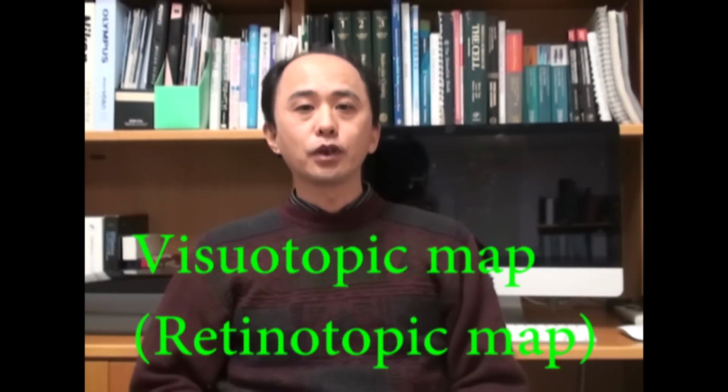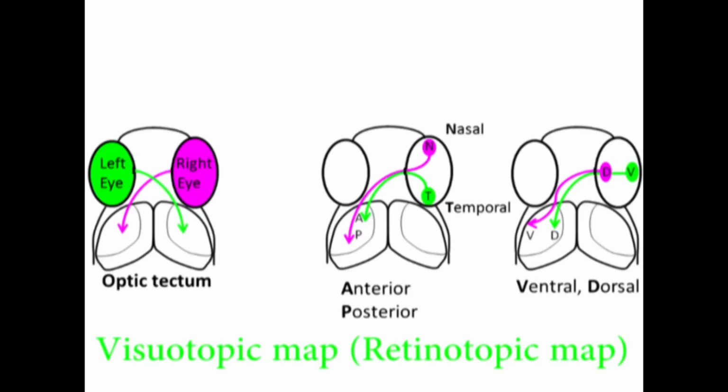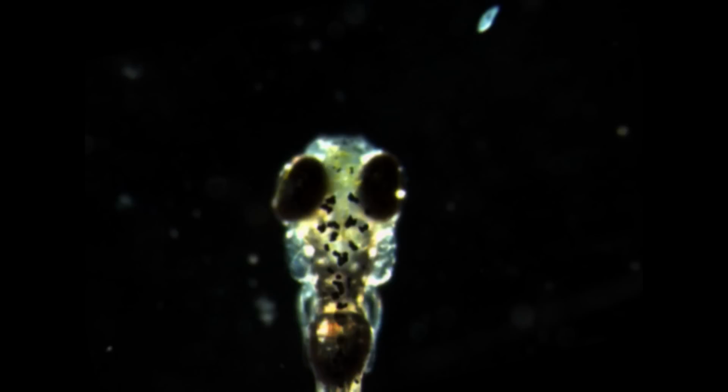Animals, including humans and fish, have common features in the brain structure. One of such features is the visual topographic map. What it means is that neurons in the brain are spatially organized so that the visual world is mapped on a part of the brain. This is a well-established notion, but no one has ever demonstrated this in real time in a natural condition. In this study, we wanted to visualize this using our new GCaMP in prey capture behavior.